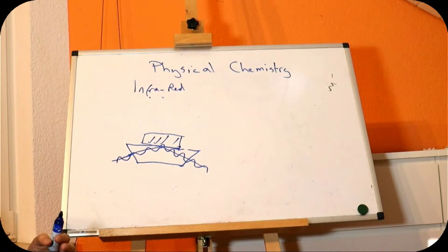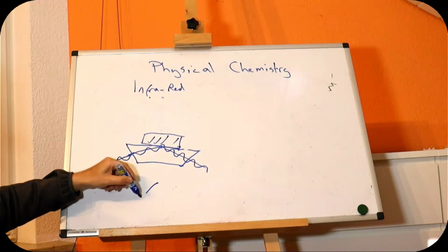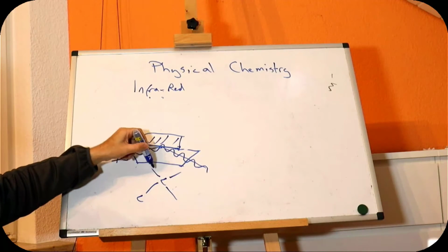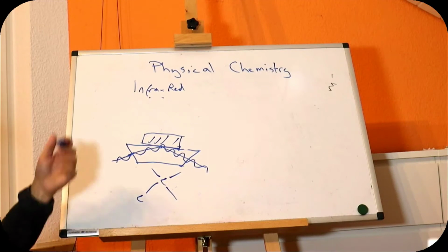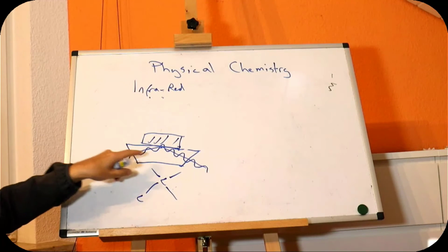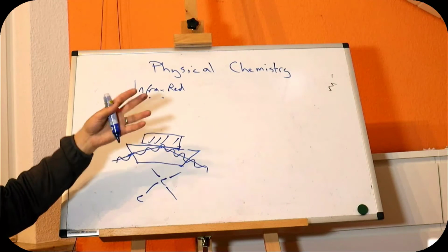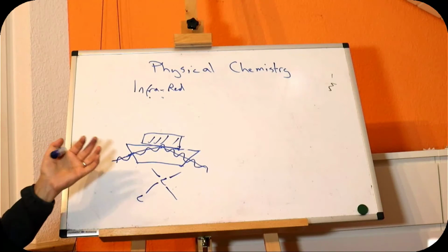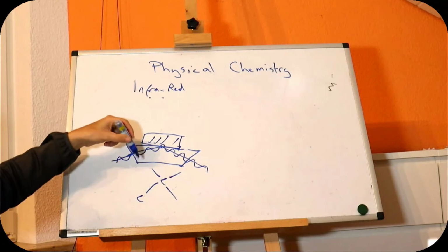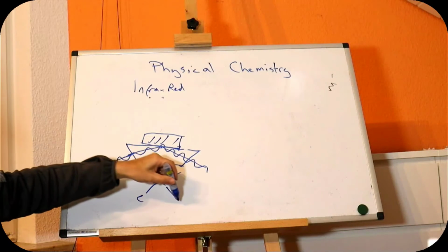For practical purposes, our one uses a diamond here. A diamond has carbon-carbon bonds of only one type, because they're in a tetrahedral arrangement. They've only got 4 bonds. It's symmetrical. It's nice and pure. And the good thing about a diamond is it's chemically inert-ish. It's very difficult to break it down with solvents anyway. We can heat it up to reasonable temperatures without anything happening. And it doesn't have infrared absorbance. Why doesn't it have infrared absorbance?